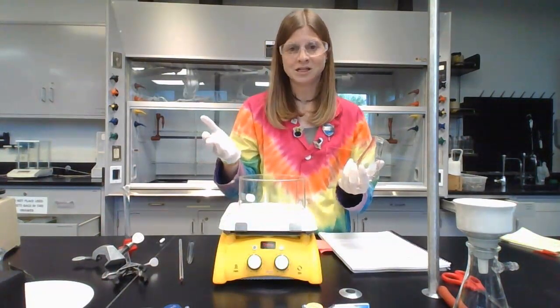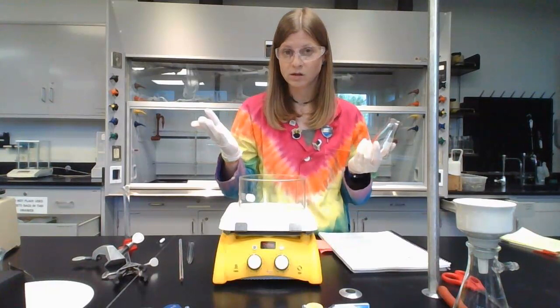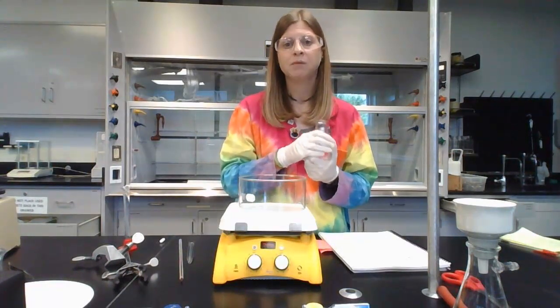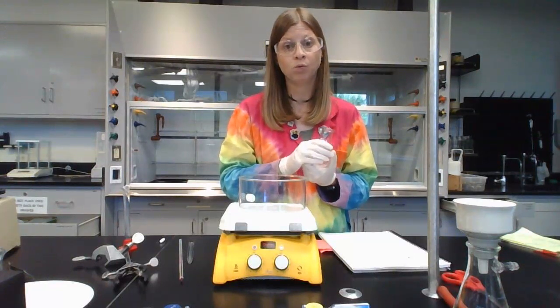If you accidentally get 6 drops, that's okay. So a little bit more is fine, but we're trying to get 5 drops. And be very careful not to get this on your skin. It will burn.